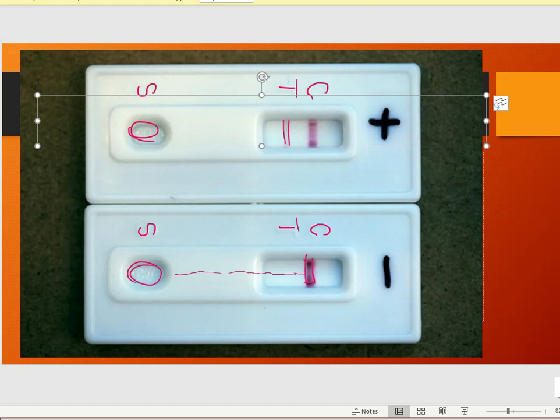And that's really all that the HemaTrace is. It's a very simple test. It's a very quick test. If you can do a pregnancy test at home, you can do these tests without a problem at all. All right. So again, you're going to see a few of these external videos of people using the HemaTrace, and they're going to show you how they go through swabbing a sample, putting it into the buffer or the solution, and then applying that solution to the HemaTrace strips. I'm going to call these strips even though they're not really a strip.